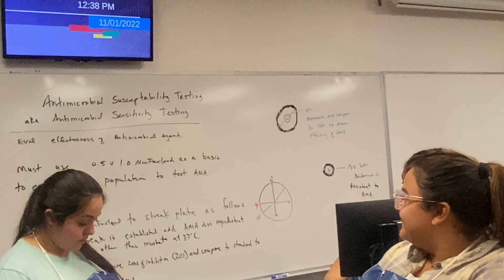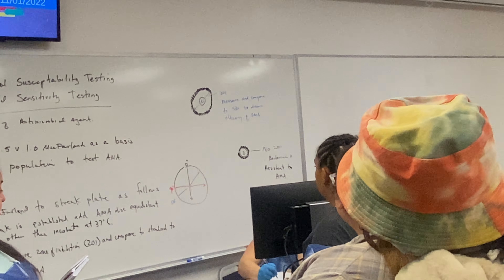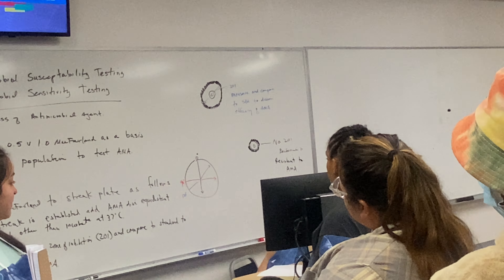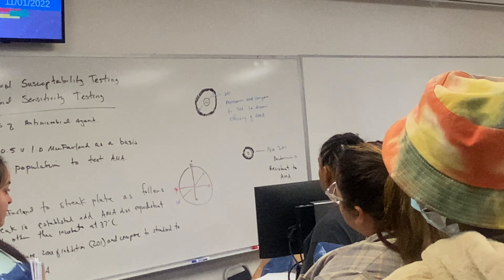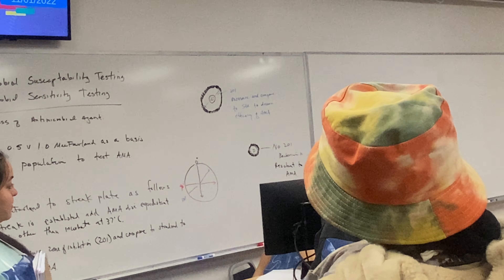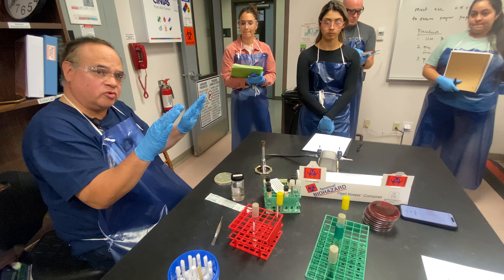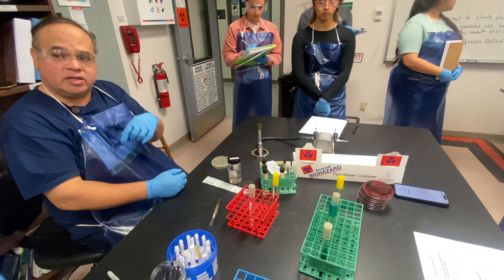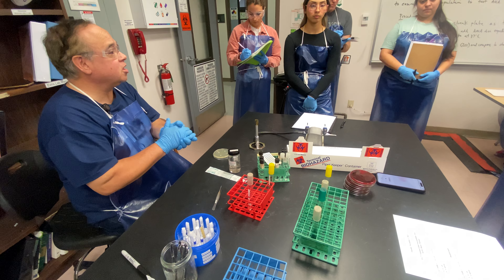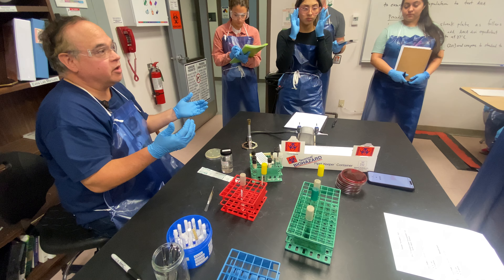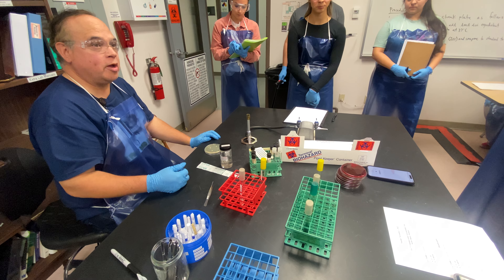On the next board you can see a disc where the growth is happening right up to the disc — the organism is growing right up to it. That means when the antibiotic diffused out into the media, it didn't have an effect on the organism, and therefore the organism grew right up to it. We say that particular organism is resistant to whatever the antimicrobial agent is on the disc. If we get that result — organism growing right up to the disc — that's an automatic resistant. When there is a zone, we must measure it and compare it to a standard. If it meets or beats that standard, the antibiotic will be effective. If it doesn't fall within the range, even though there's a zone, it's not going to work, and we would not use that antibiotic for a patient with that particular infectious agent.